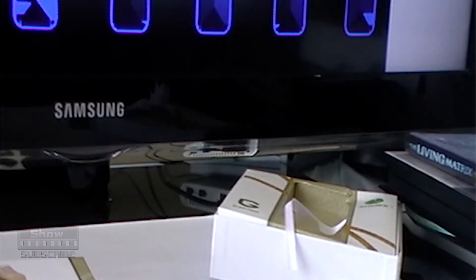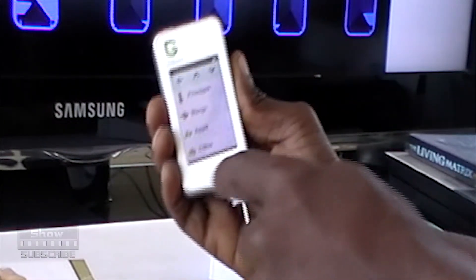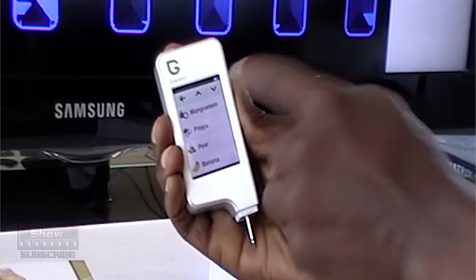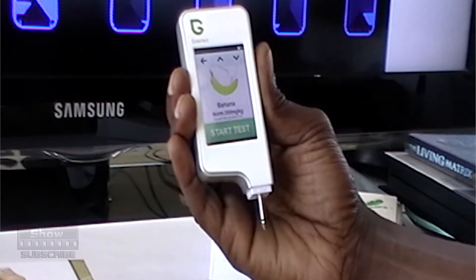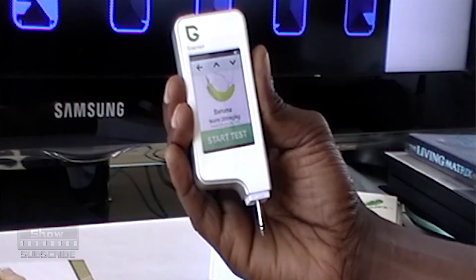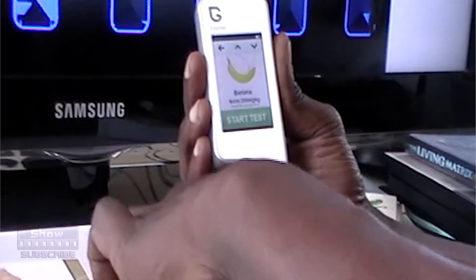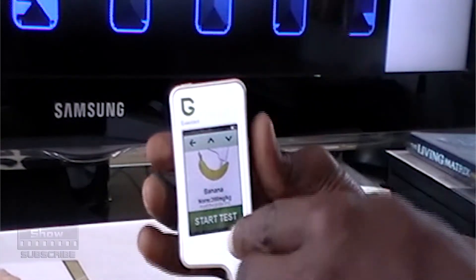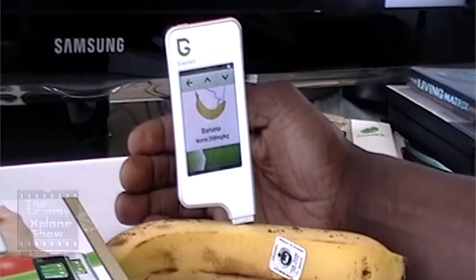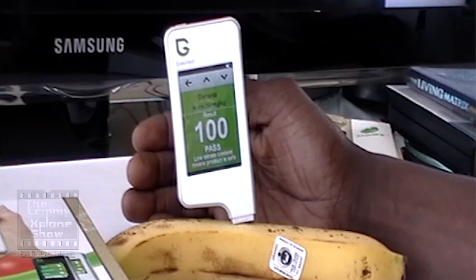Once again we're going to look for our fruit — this time the banana. The touchscreen could definitely do with some work. With the banana, the normal will be 200 milligrams per kilogram. This banana is certified organic and fair trade. We're going to probe it, press start, and the result is 100 milligrams per kilogram — so this also passes, just hitting the halfway mark.